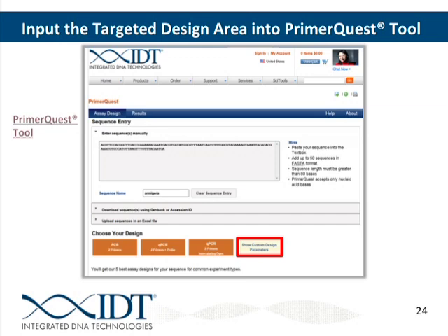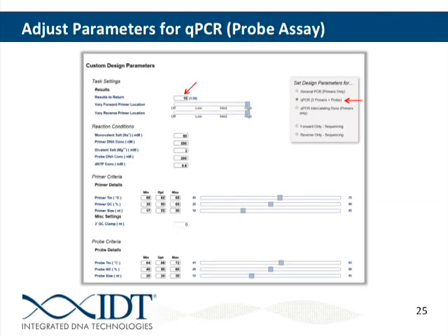And so in doing so, we get this assay, which we can then overlap onto our Clustal alignment and make sure that that looks unique, and then take those sequences to BLAST again to make sure that they really do only recognize our one strain of interest.